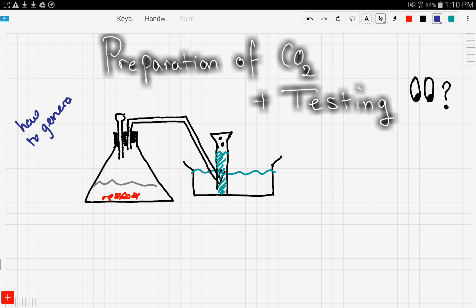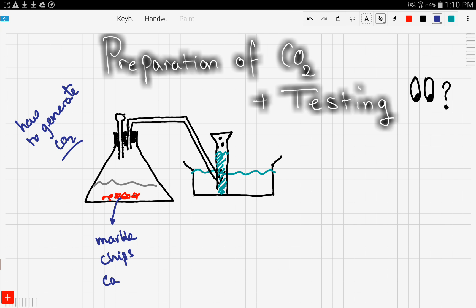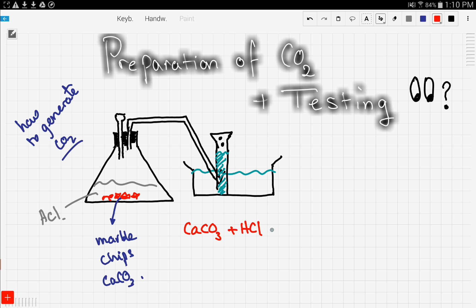First, these chips are marble chips, also known as calcium carbonate or limestone. The chips are put into a hydrochloric acid solution and this reaction occurs: calcium carbonate reacting with hydrochloric acid gives carbon dioxide gas, plus water, plus calcium chloride.